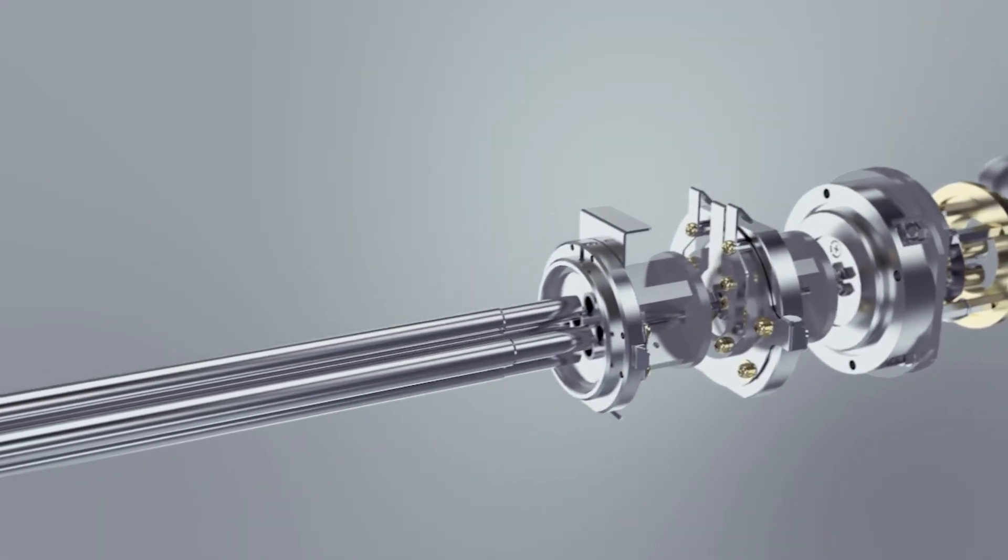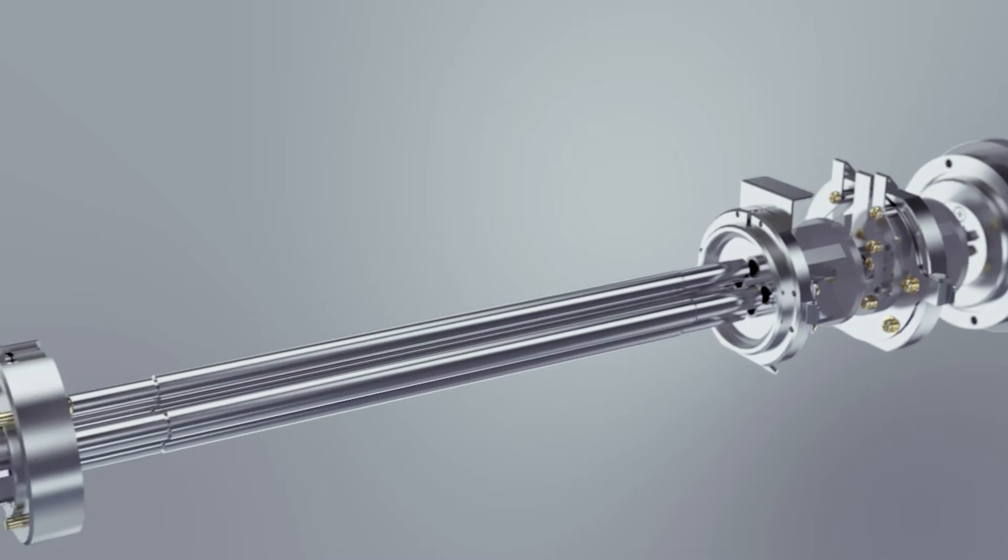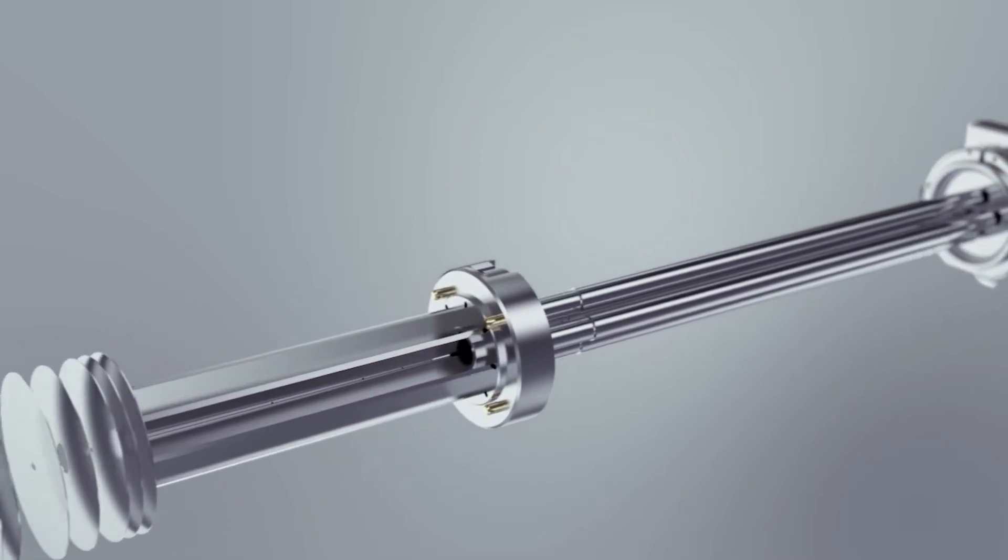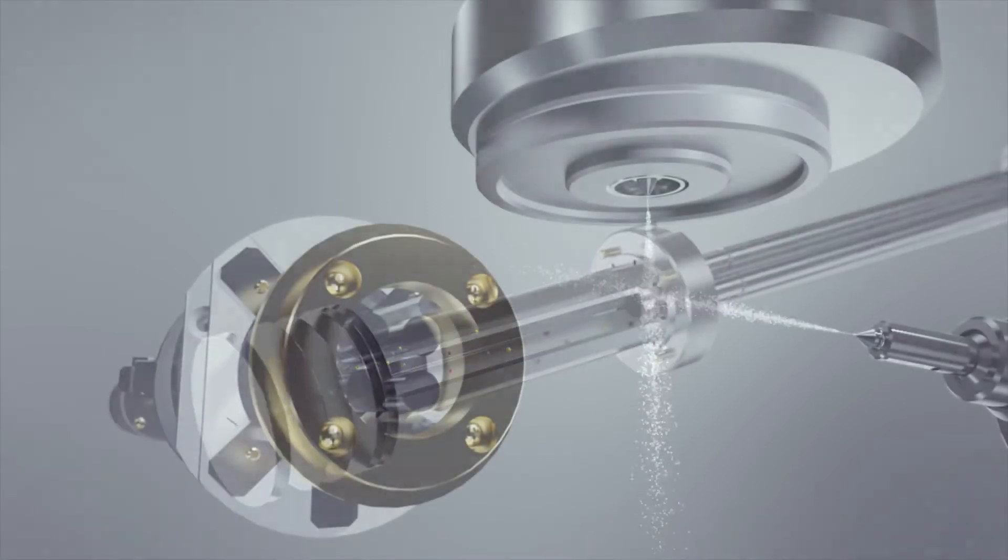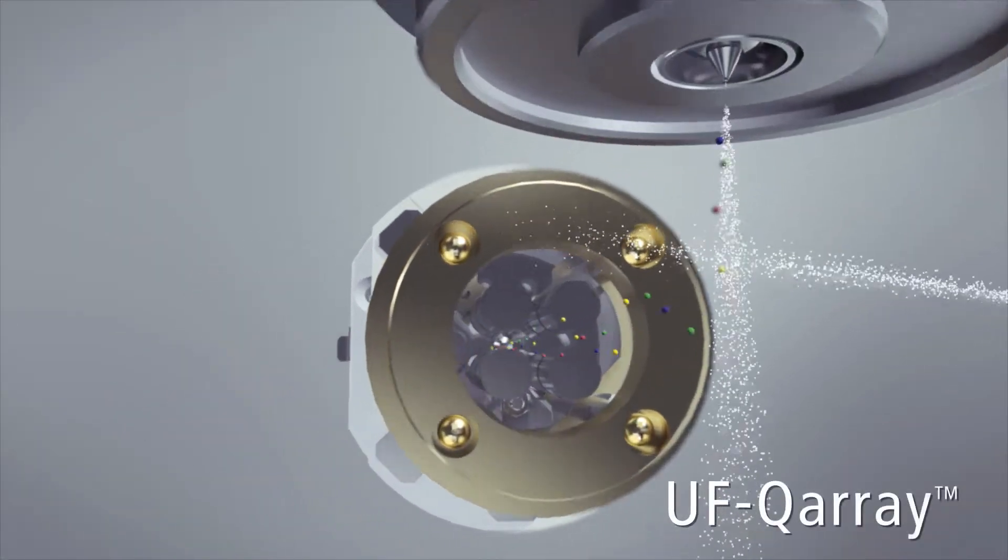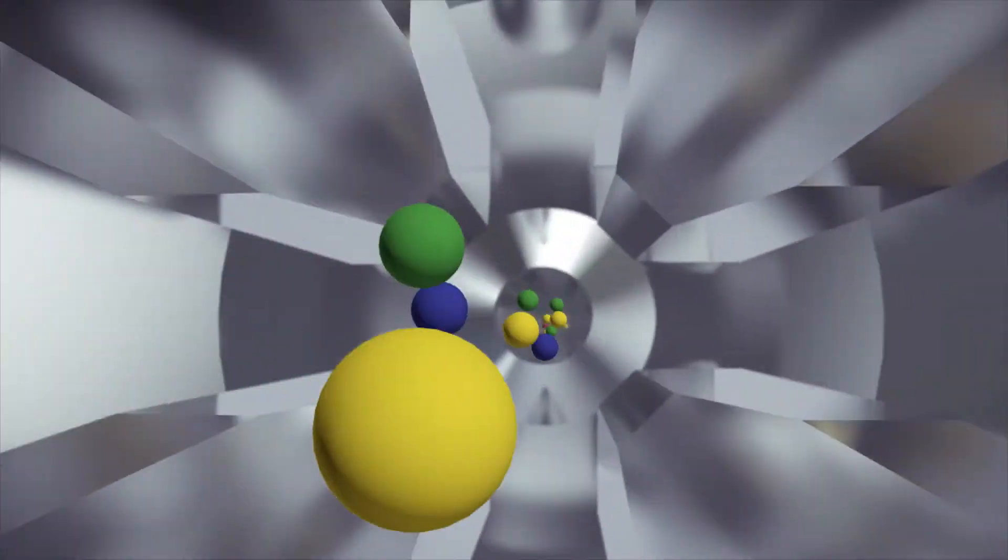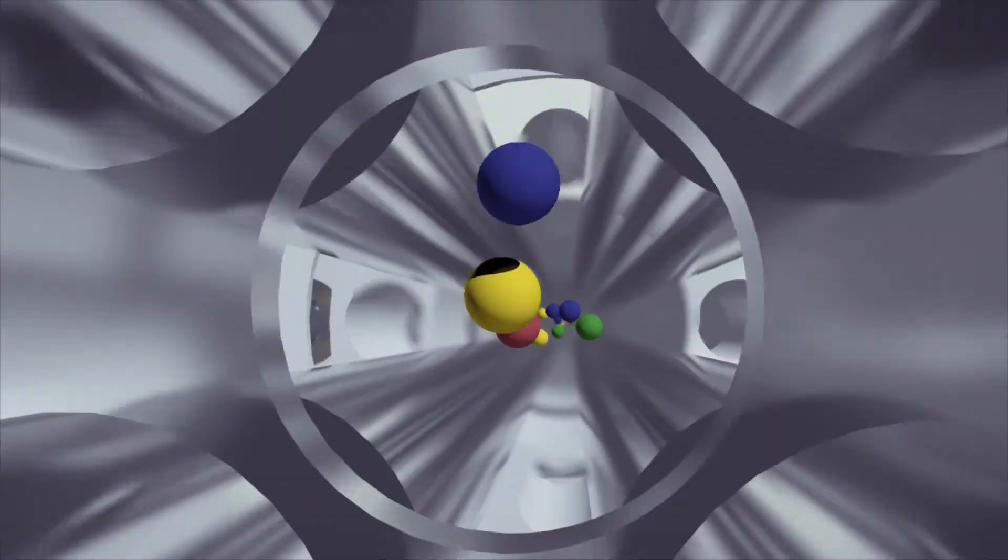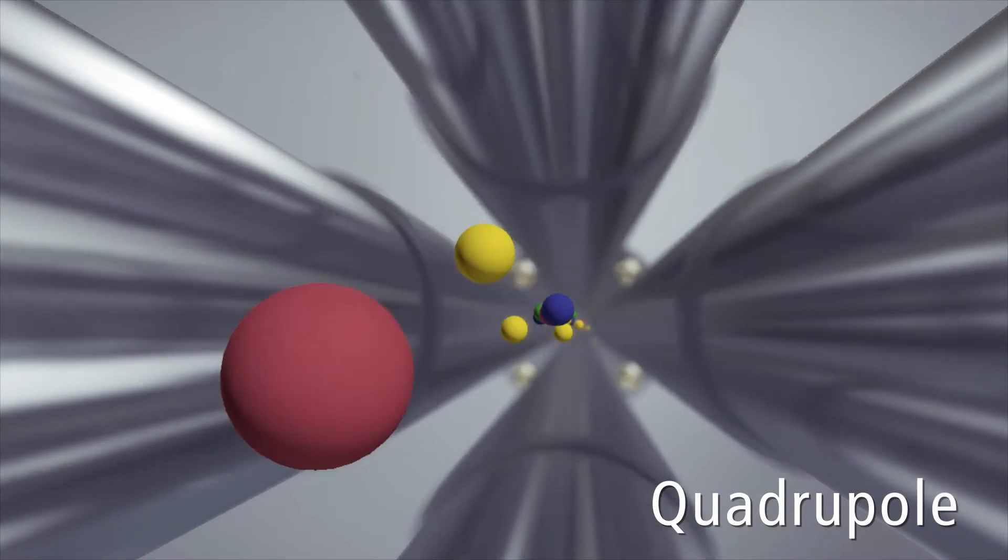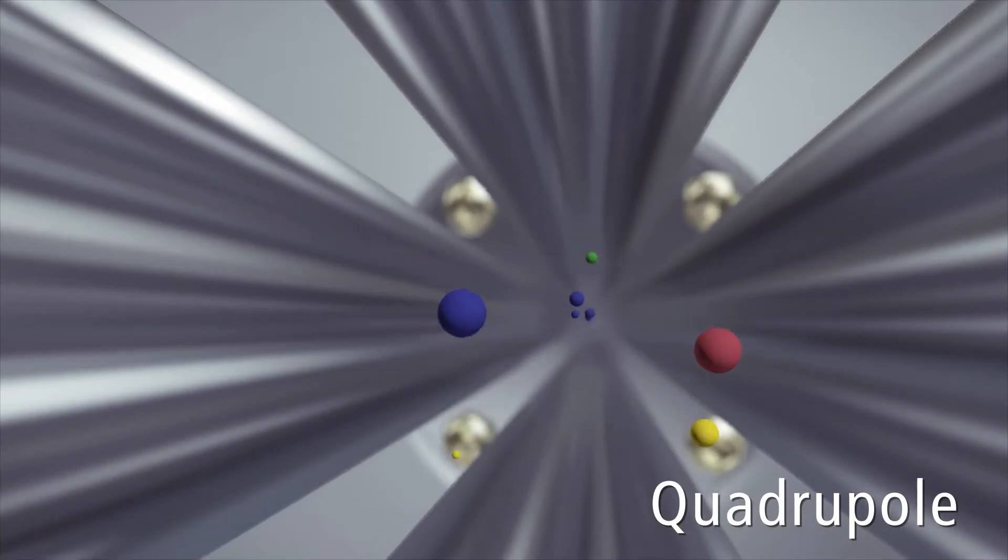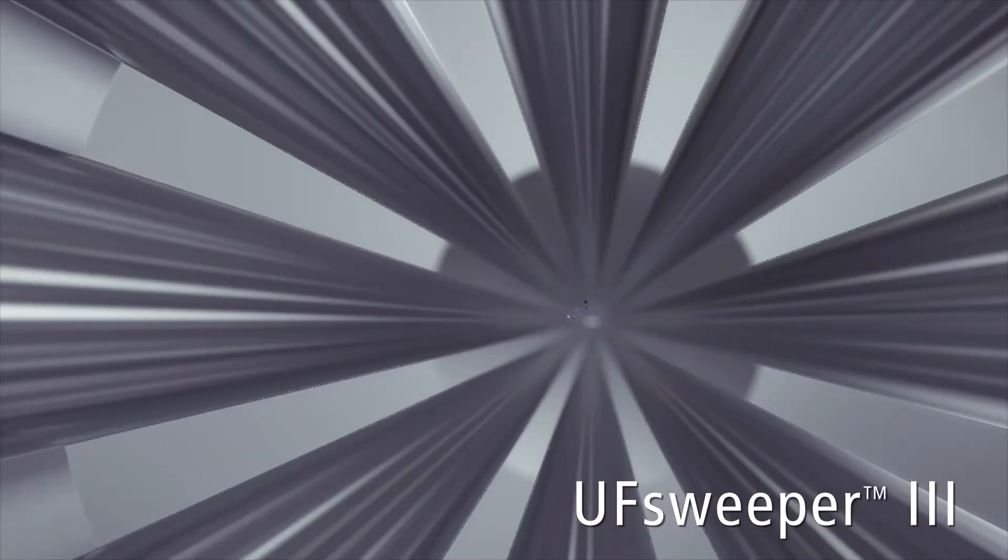The LC-MS 9030 builds on Shimazu's key technologies used in the world's fastest and highest sensitivity triple quadrupole mass spectrometer: the UF-Q array, true hyperbolic quadrupoles, and the UF sweeper 3.